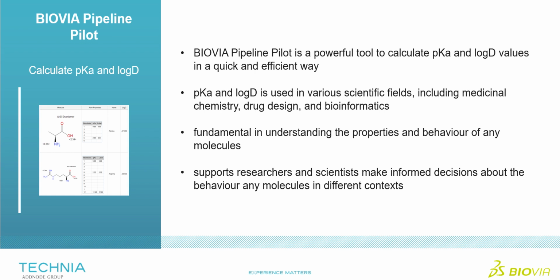BIOVIA Pipeline Pilot equips us with a powerful tool to calculate pKa and logD values for any molecule, in this case, natural amino acids. This knowledge is fundamental in understanding the properties and behavior of these amino acids in various scientific applications.